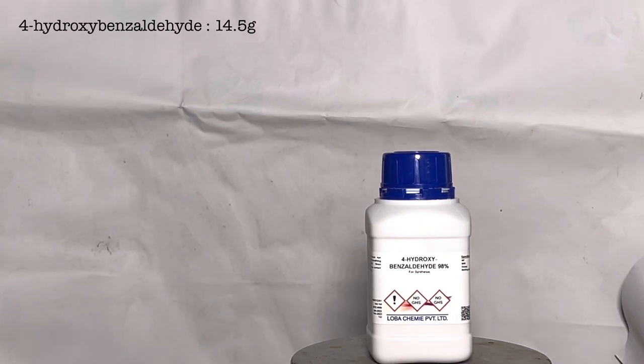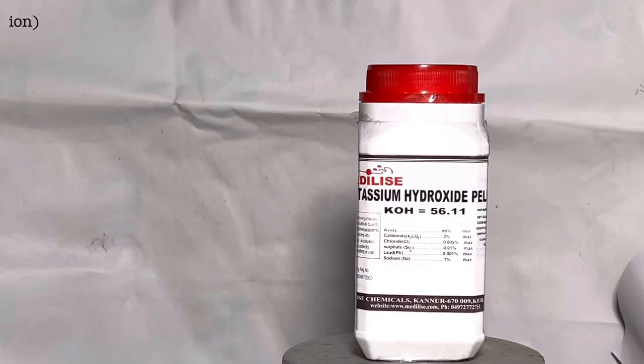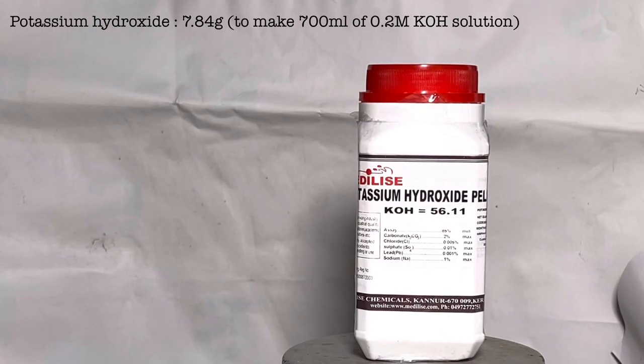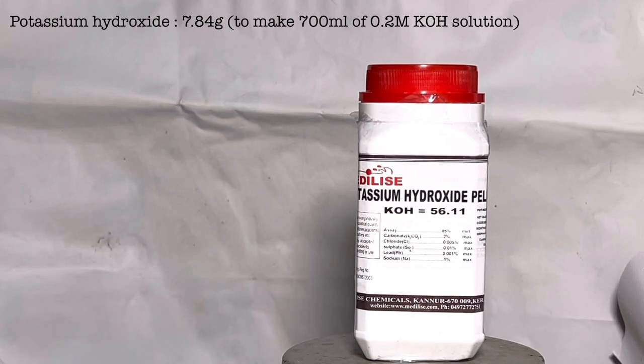We also need 14.5 grams of 4-hydroxybenzaldehyde, 20 milliliters of dry isopropanol, and 7.84 grams of potassium hydroxide pellets to make 700 milliliters of a 0.2 molar solution.